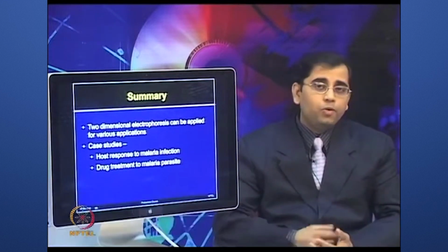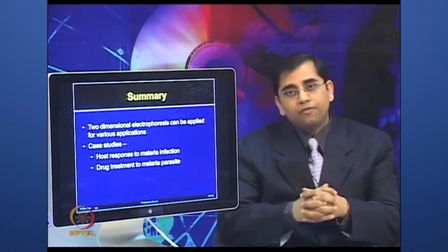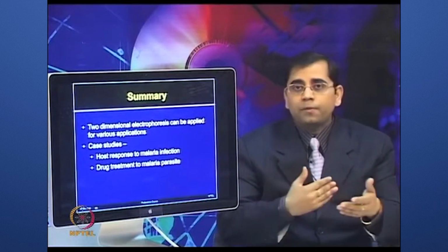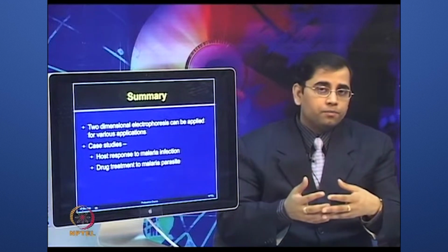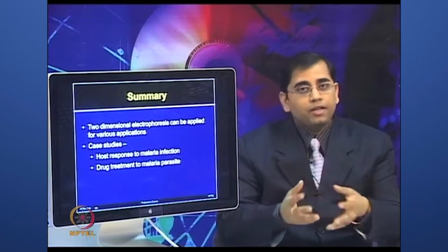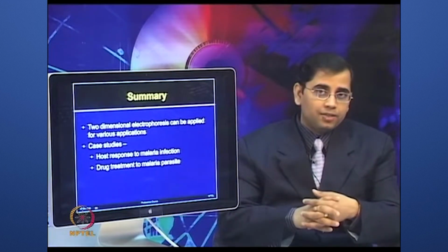But by giving you a case study and details of various types of experiments one needs to perform, probably you got an idea that before performing that final experiment on your case and the controls, a lot of optimization has to be performed, starting from your sample processing and how you can expand the coverage of the proteome. These types of quality control checks are very essential.